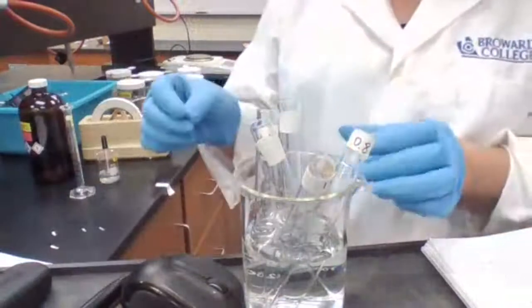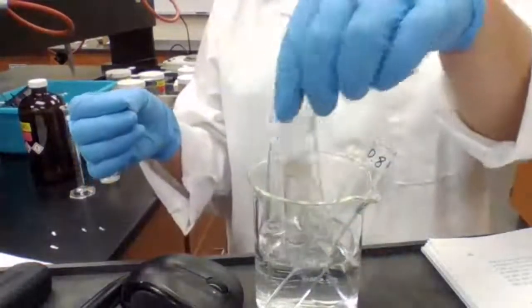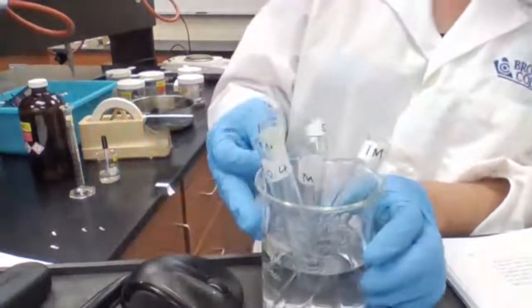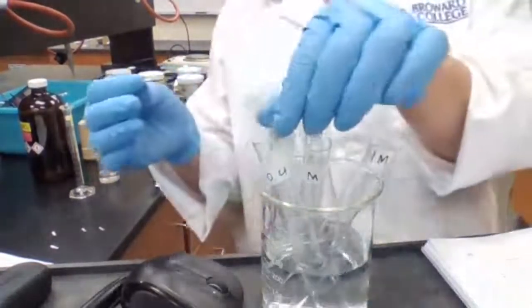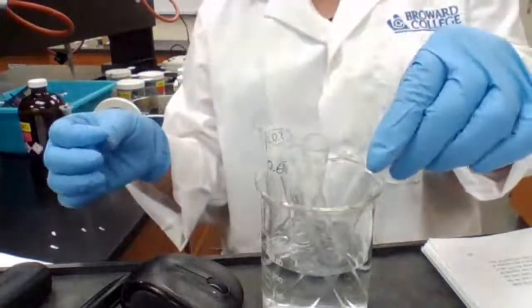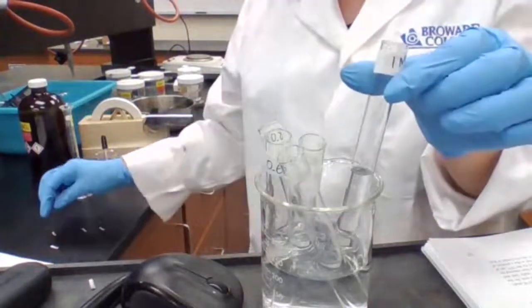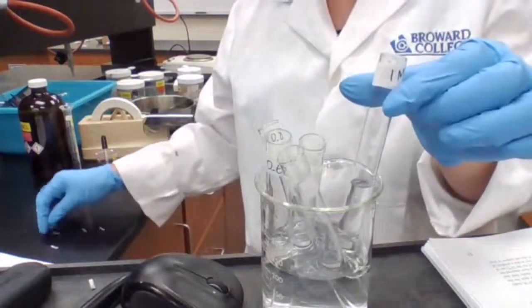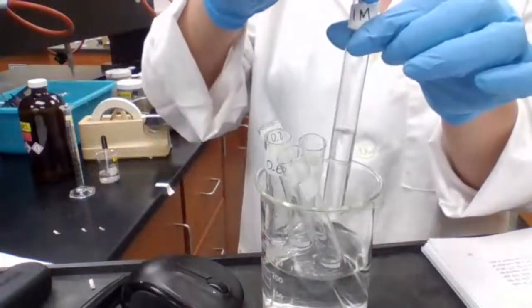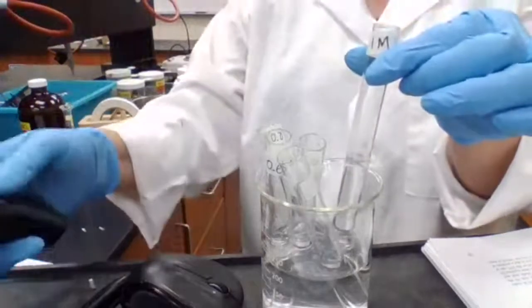Okay, so I'm going to start with the one with the lowest concentration, I guess, or the highest concentration. I'm going to try one at a time, because with the 1 molar, this is the 1 molar, I don't want to have to start all over again, so I'm going to add the magnesium to the 1 molar solution and start timing.